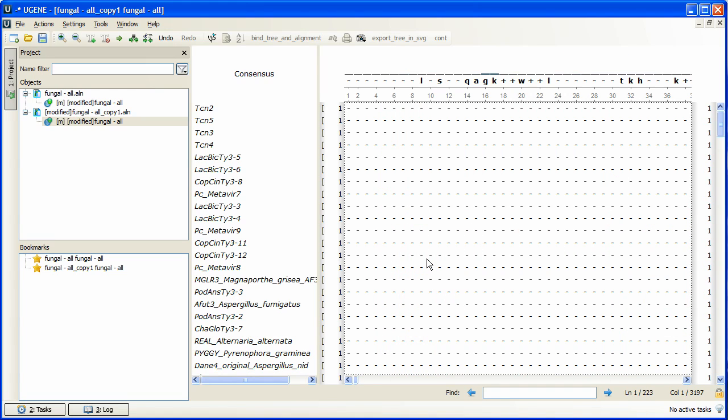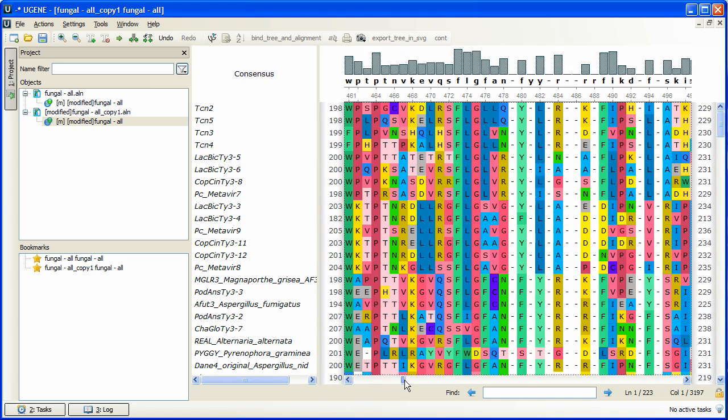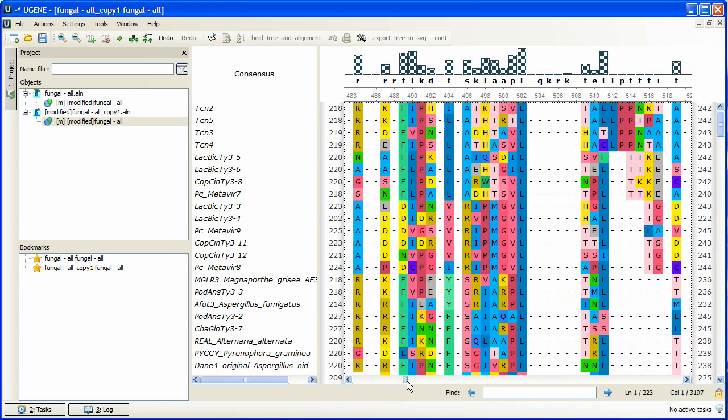It takes only 3 seconds for the task to finish. We can see the result in the alignment. It consists of sequences of length up to three thousand symbols, so it's a different alignment.